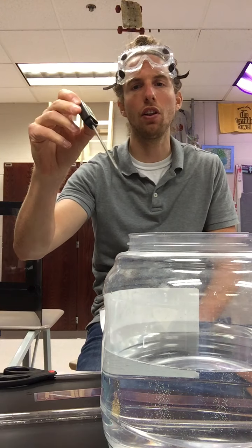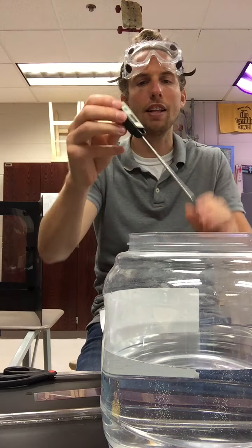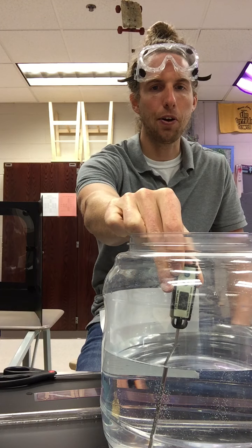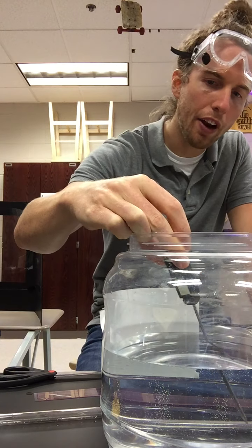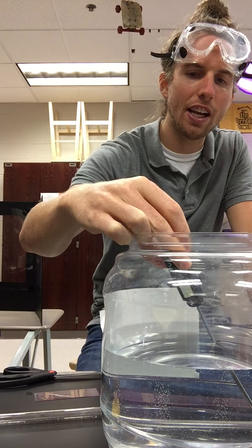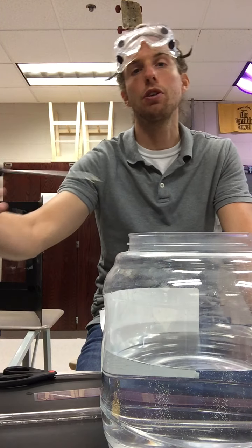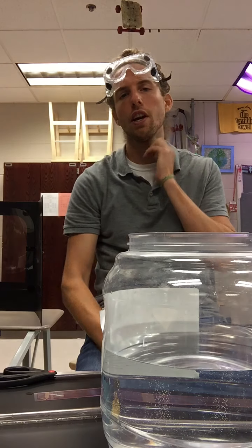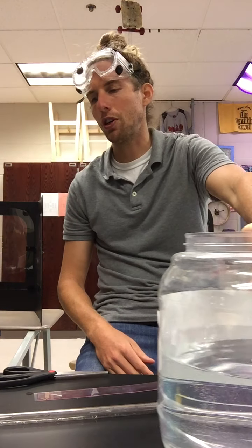So I have myself here a little thermometer. If I go ahead and put that down into the water, I'm not sure if you guys can see that at home. Let me turn it around. I'm getting a reading of 20.0 degrees Celsius, which makes sense because we're right around room temperature, so 20.0 for Celsius makes a lot of sense.